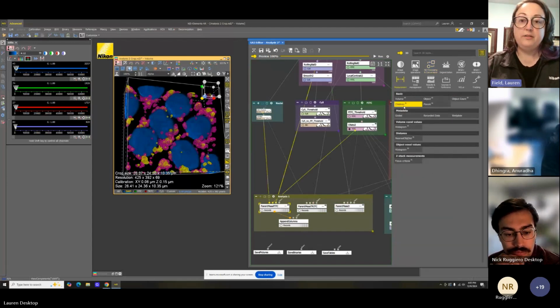There's a children one, so this is if you want specific information of the children. And then there's a parent one where you want specific information related to the parent. So how many children per parent? Children gives you slightly different outputs for, I want a variety of different information about each of the children for a single parent. I just did parent measurements on these.